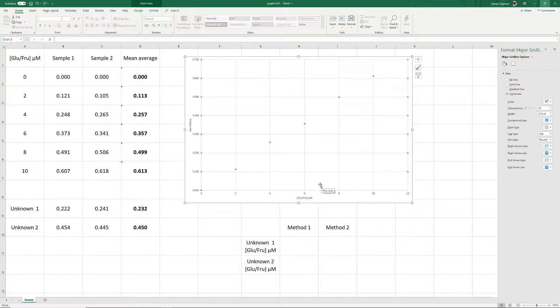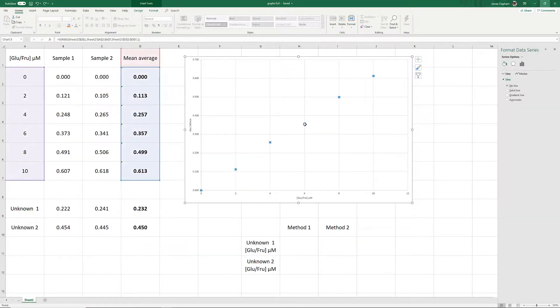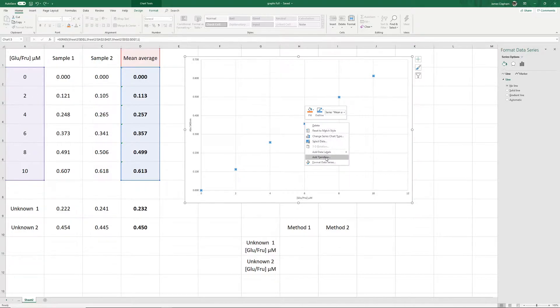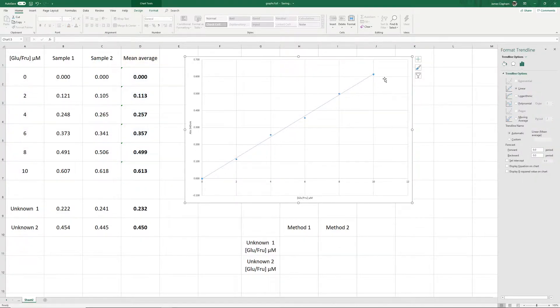The next thing we need to do is add a line of best fit. This is very simple to do. We just click on one of the data points, right-click, and go to Add Trend Line. You can see Excel has put in a line of best fit for us.